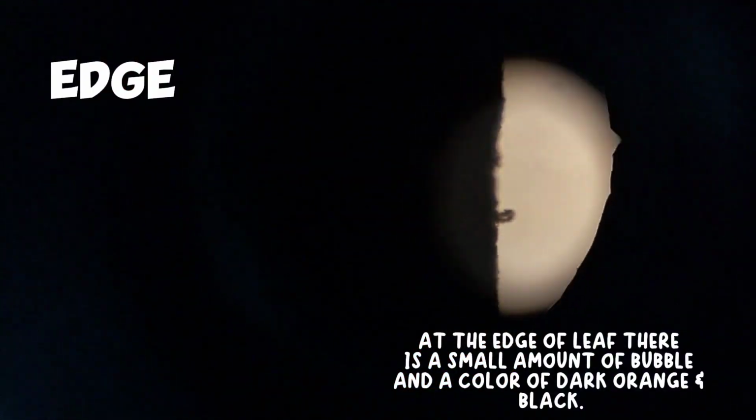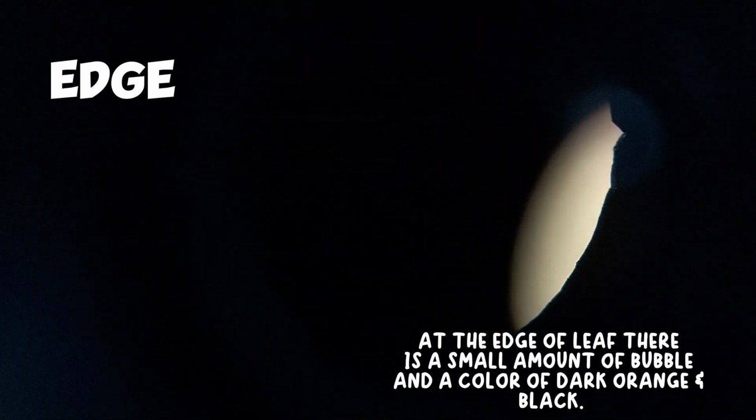At the edge of the leaf, there is a small amount of bubble and a color of dark orange and black.